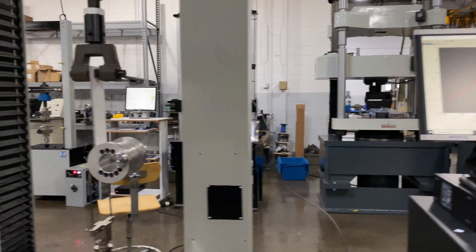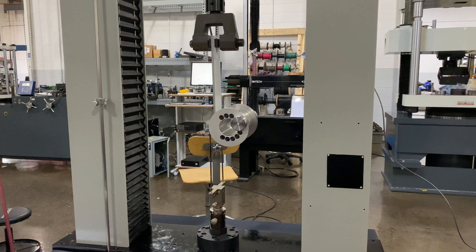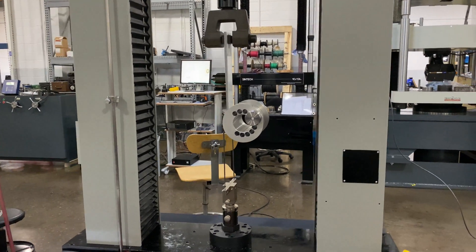As you can see, that load is held steady and then climbing as it starts to peel up the sample.